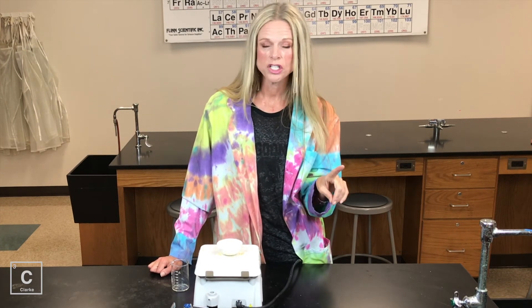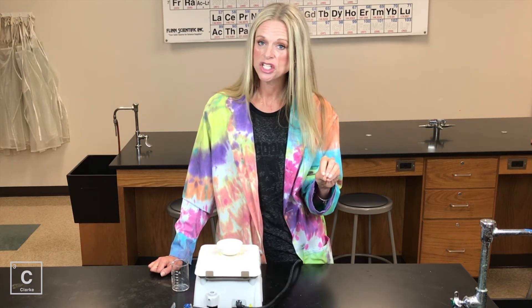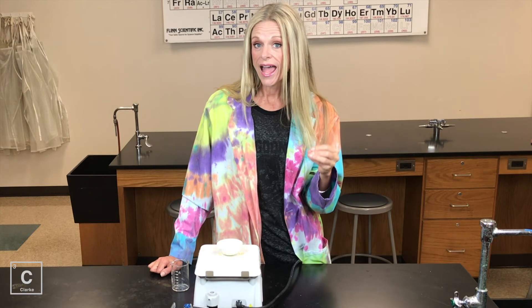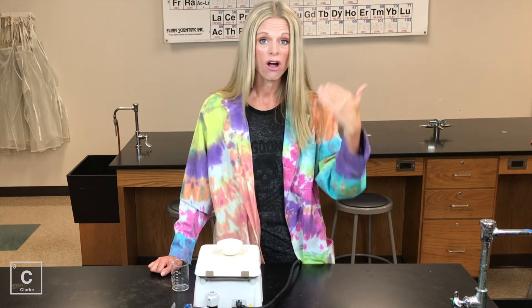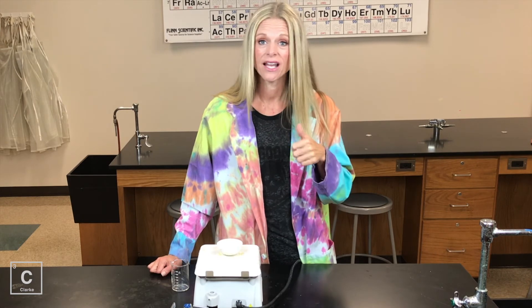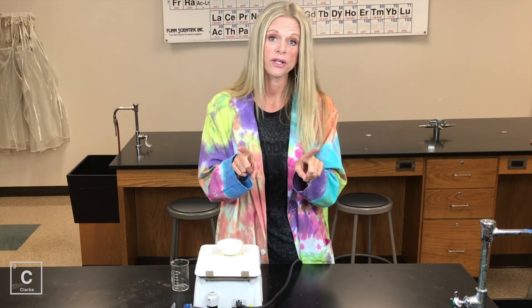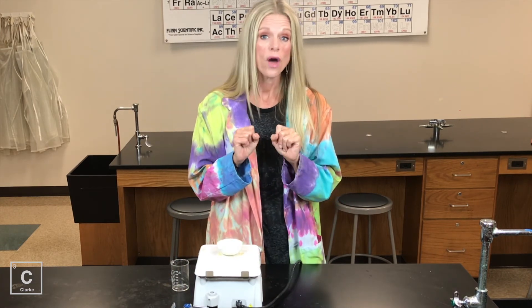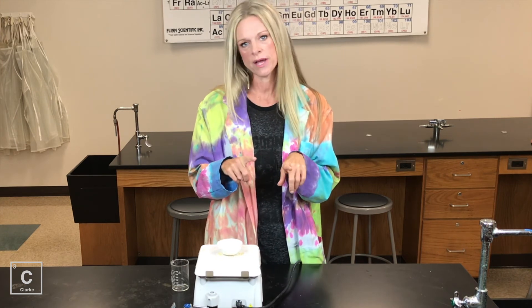The number one precaution when you're doing evaporation is as the liquid starts to boil off, sometimes the solid particle left behind is going to start popping. You don't want that to pop out on you, so always be really careful whether you're using the hot plate or the Bunsen burner.